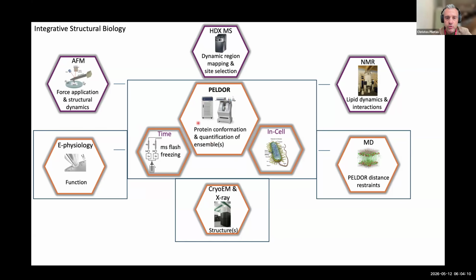We have focused on the EPR methodology, which I'm going to briefly touch on and explain to you what we can do. The idea is that we monitor conformational ensembles of membrane proteins, and the most interesting or novel states we then pursue by cryo-EM. We have expertise in our group in X-ray crystallography to solve these high-resolution structures. We do a lot of computational work as well, in which we employ molecular dynamics simulations to restrain the distances that we obtain from this main methodology. And we also do a lot of electrophysiology to characterize especially the ion channels. I'm going to show a little bit on this as well, along with some native mass spectrometry we've done in SMALPs.